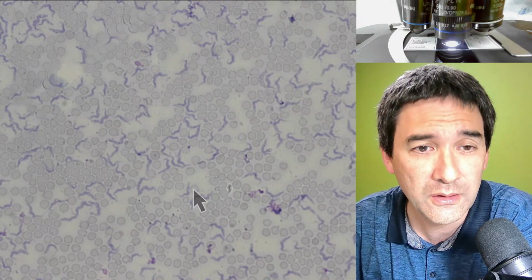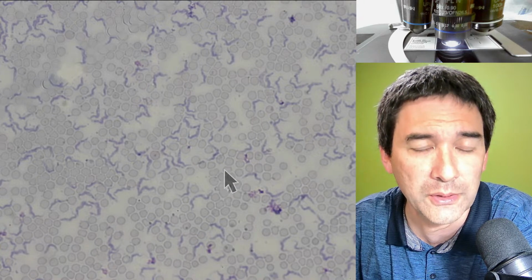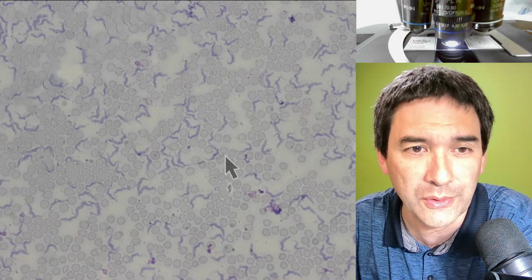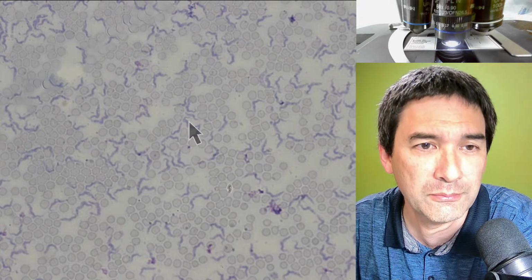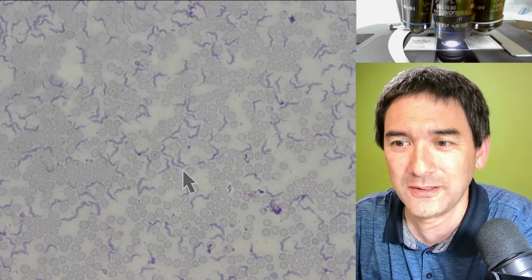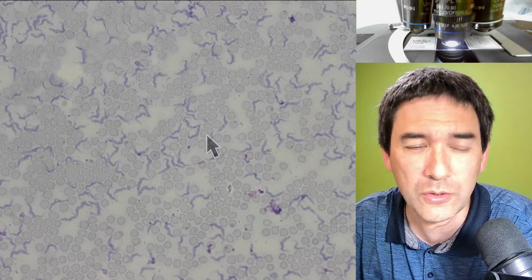Okay, and here evidently they use a stain that stains them darker, and the red blood cells are still quite pinkish and pretty bright in the background. And I think the concentration of those parasites here is pretty high.